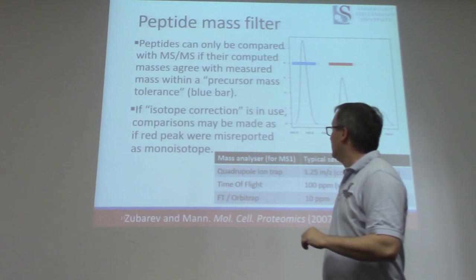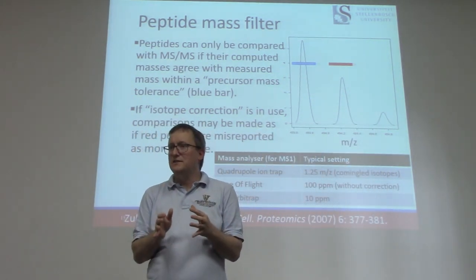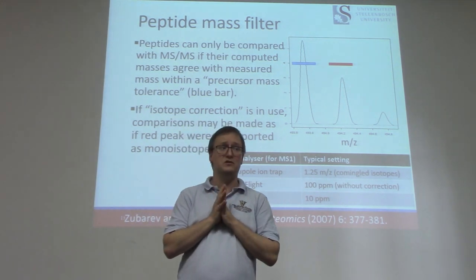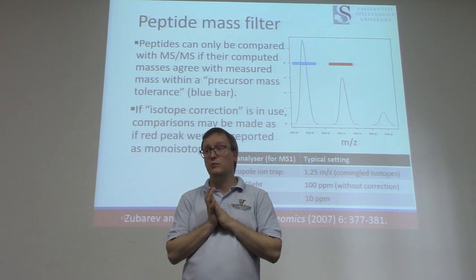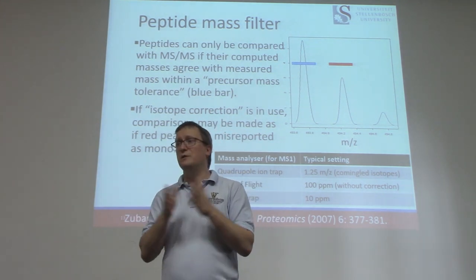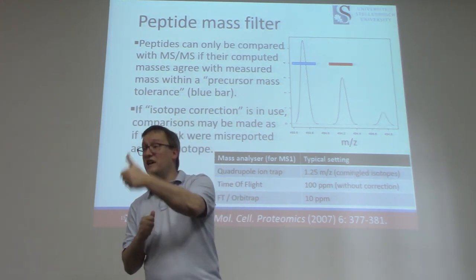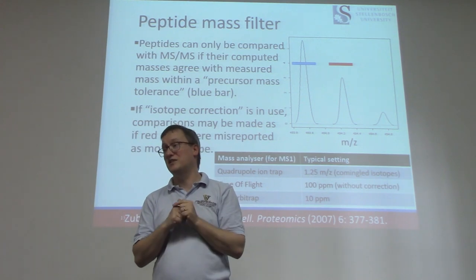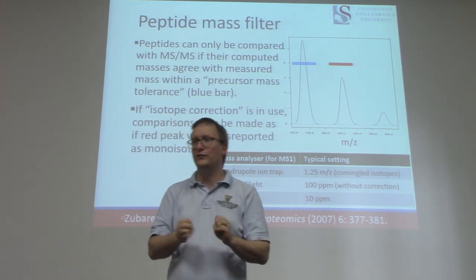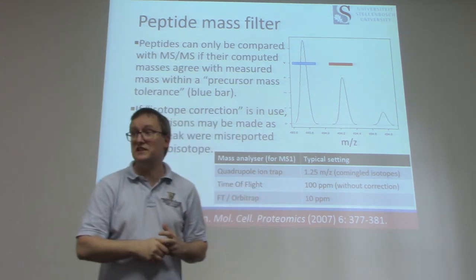Okay. Generally speaking, today, high mass accuracy is a characteristic of lots and lots of mass spectrometers that we would use. For example, the Center for Proteomic and Genomic Research here in town has a Q-Exactive. The Q-Exactive gets accurate mass measurements for both the peptide ions themselves and for the fragments that they produce, which means that we have a lot better bead on where to look for a given ion. We don't have to allow for as much mass error in doing this matching process.